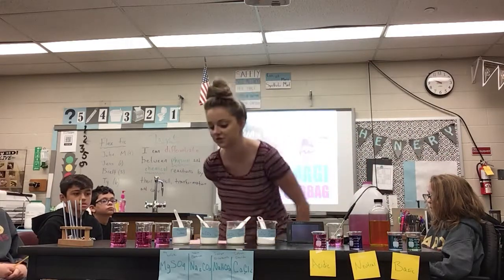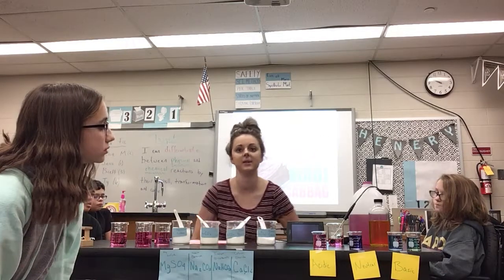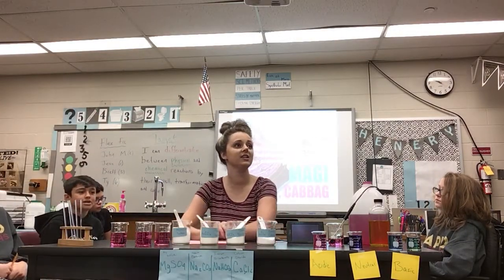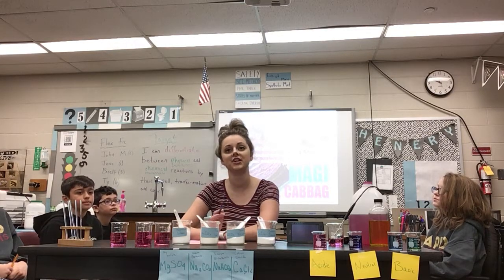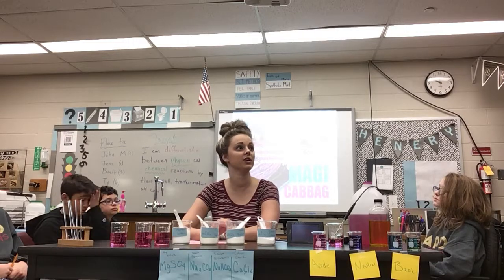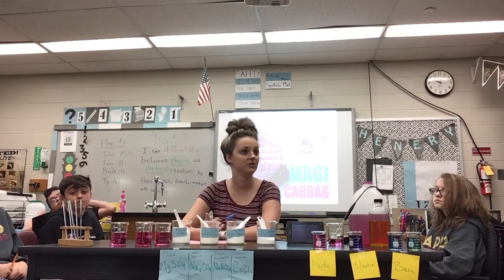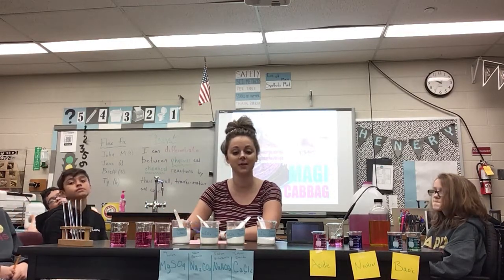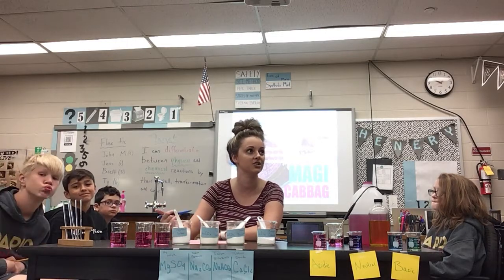Now guys, by temperature change, what are we stuck at right now? About room temperature, 70.3. If it goes to like 70.4 or even 71, is there a temperature change? Yes, but we're looking for drastic. We're looking for endothermic or exothermic. And then the last thing is we're going to see, was there a chemical change, which means that there would be a smell or there would be a drastic color change.